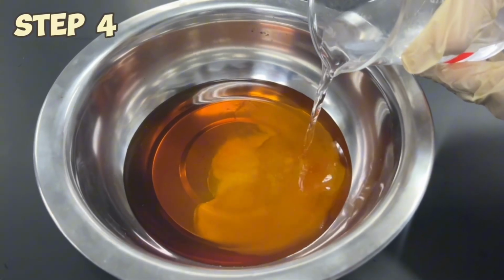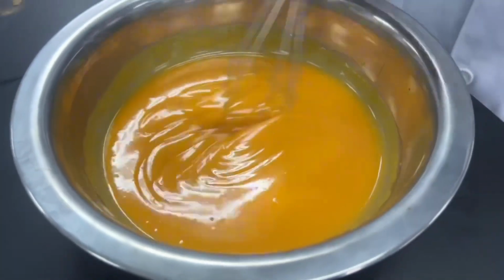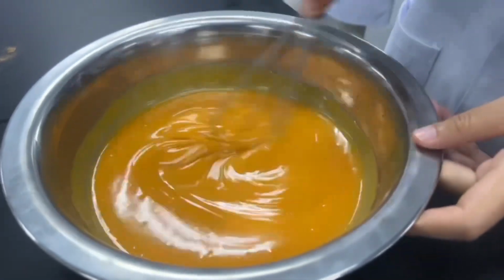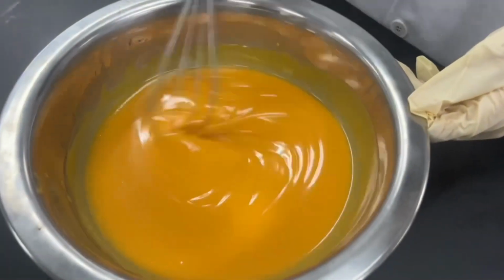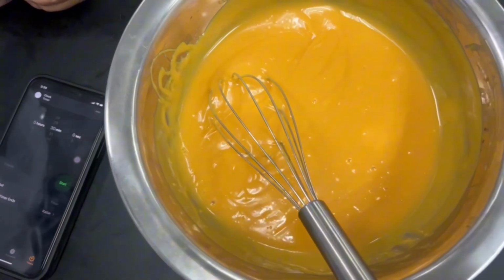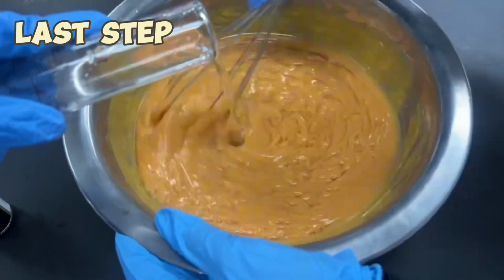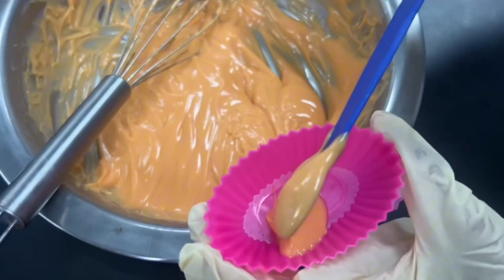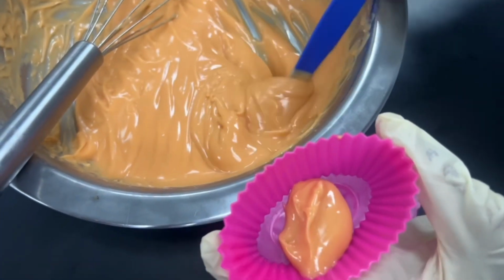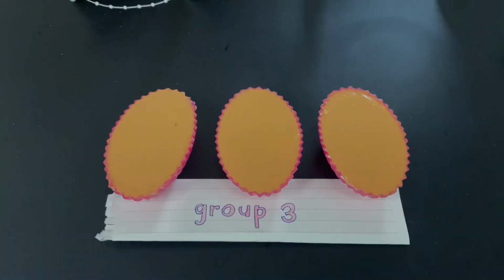After cooling, we added the sodium hydroxide to the oil and mixed it with constant stirring for 30 minutes until the solution began to precipitate a white solid. Lastly, we added food coloring in 80 ml of water and continued to stir the mixture. The soap solution was poured into a silicone mold and left to dry for 20 to 48 hours.